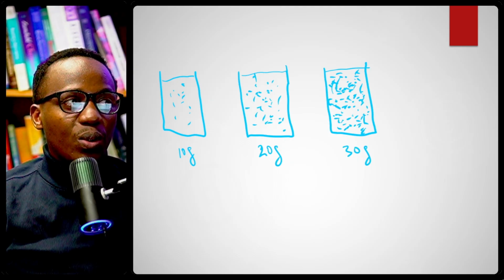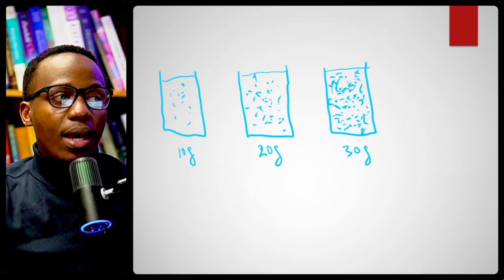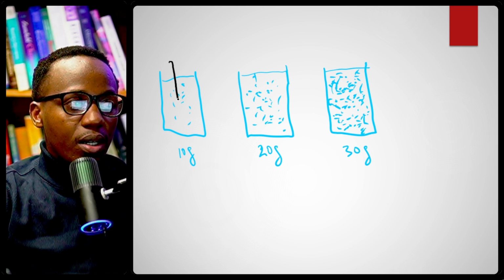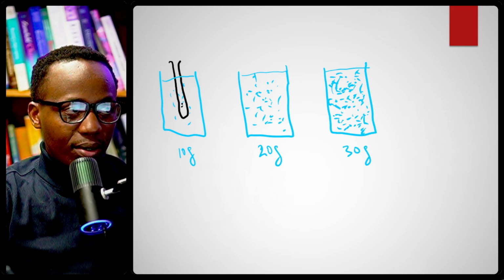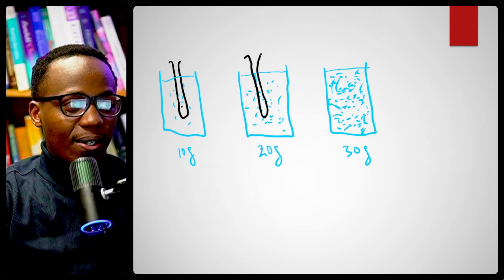It's actually really cool. We are going to add a tube in there. We're going to add a tube with pure water here, right?